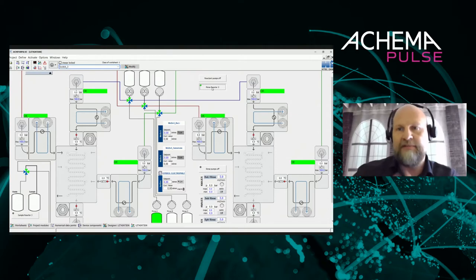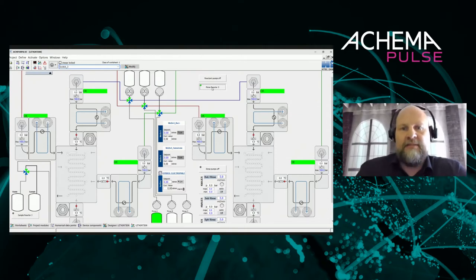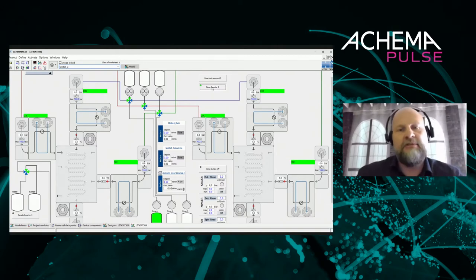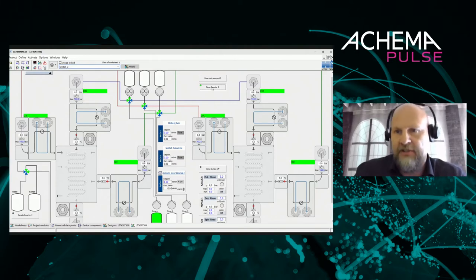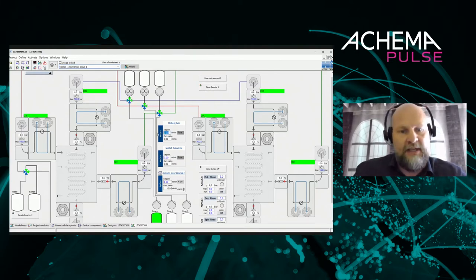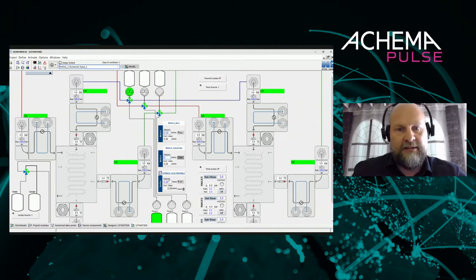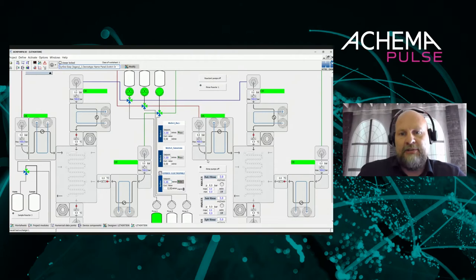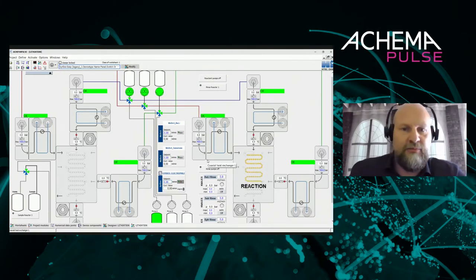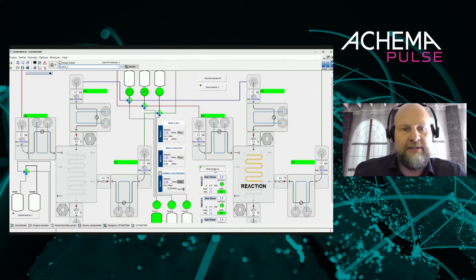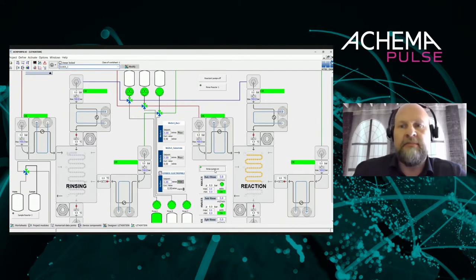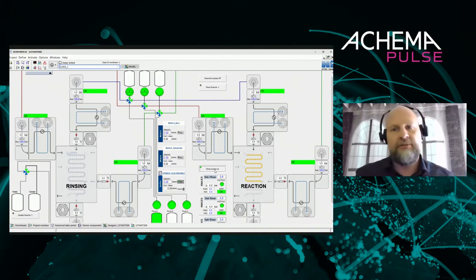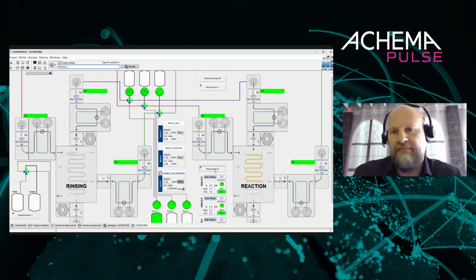Behind this graphical representation there is a real valve doing the switching, because we also have an operator sitting in front of the screen. There are some graphical elements that allow you to visually monitor what's going on. Let's say we now start the reaction by starting the pumps — and we get a representation here that the reaction is running in one of the reactors. I could, for example, switch on the rinsing on the other reactor so the operator can see what's happening. For an experienced user this can all be set up within one or two hours.